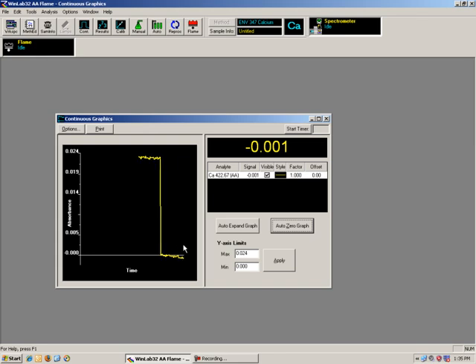At this point, we would want to go through a series of routines on the instrument itself that I can't show you. We would typically place a card in front of the light beam and make sure that the beam is just barely above the burner head, and that the burner head is not interfering with the beam.